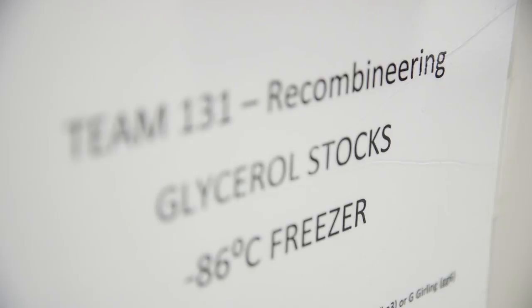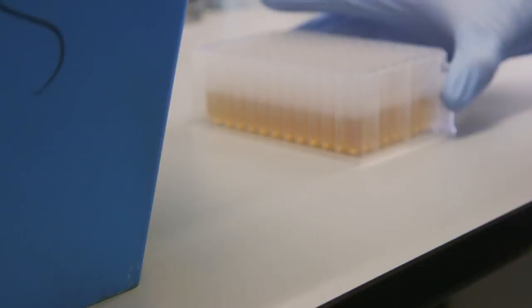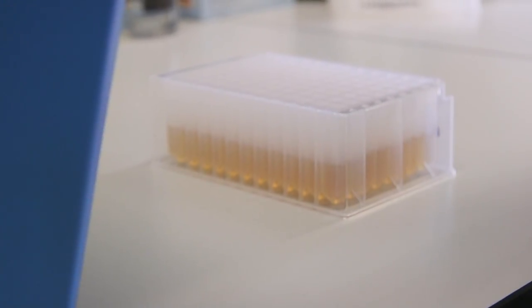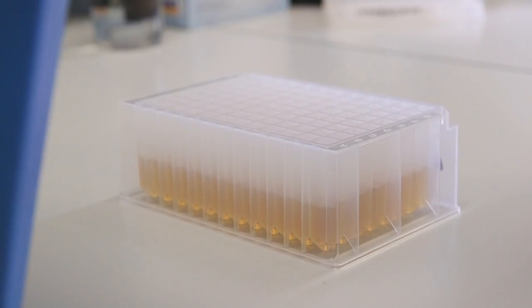Next, a crucial step called recombineering happens in bacteria. Each of these bacterial cultures harbor a specific short piece of malaria DNA that contains an individual target gene identified at the design stage.